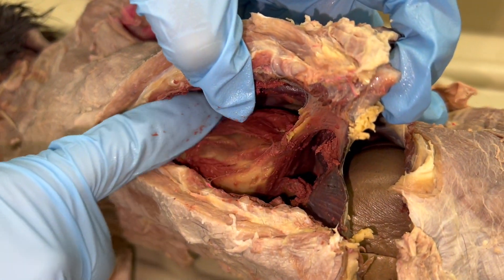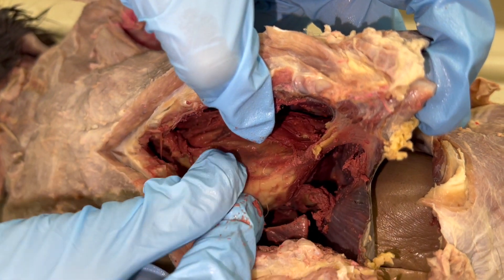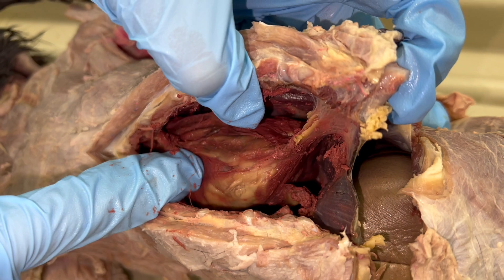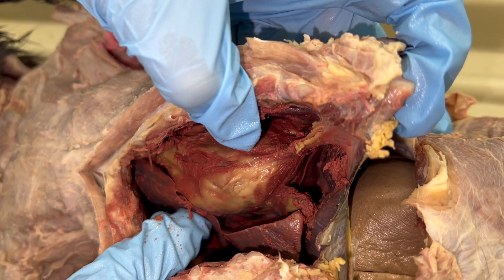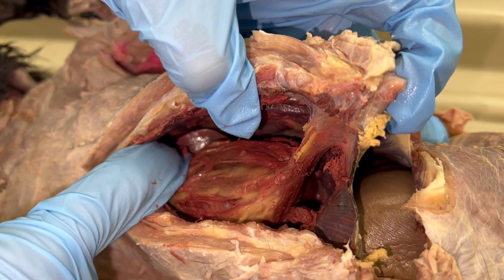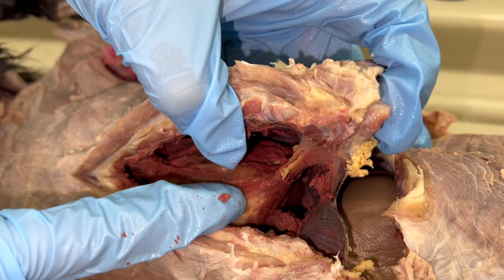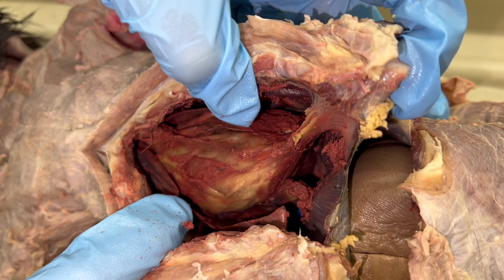The heart is in a pericardial sac and there's fat on that pericardial sac. You don't want to bother with removing the fat from it — you just want to cut into the pericardial sac and pull away the pericardium from the heart.